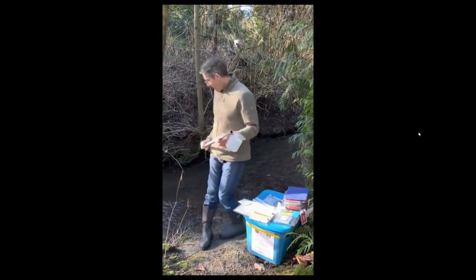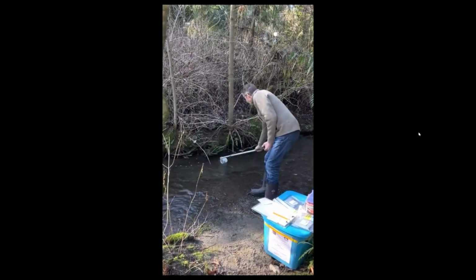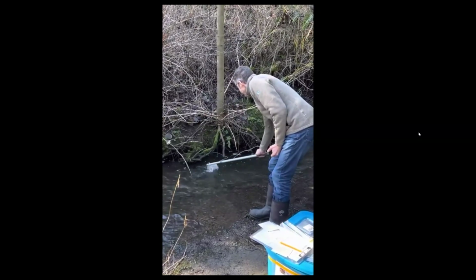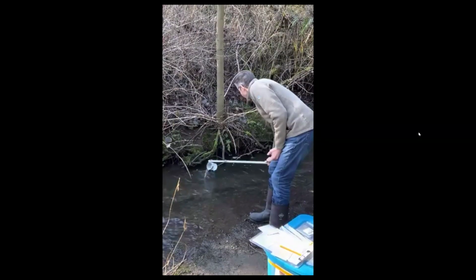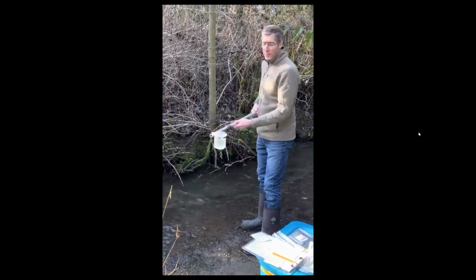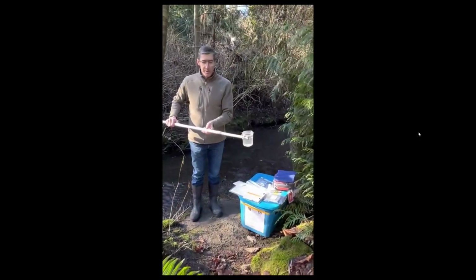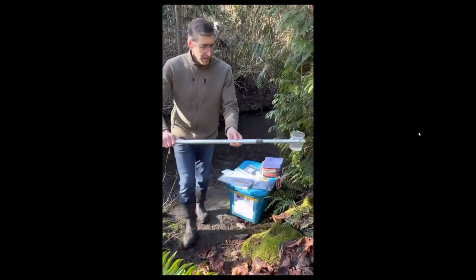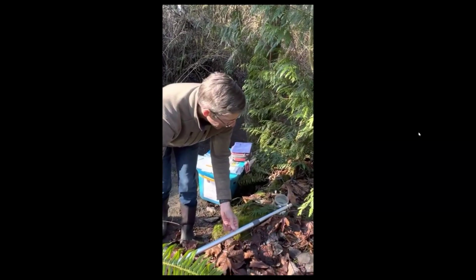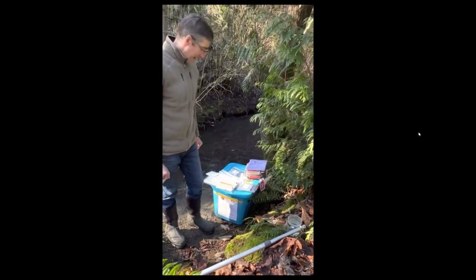So with the dipper, this is something that you're going to want to rinse out 2 to 3 times with stream water. Collect your sample. And this is something that some programs like because you can use this without getting into the stream. So I'm going to collect this sample and I'm just gonna set it somewhere stable. You could have a helper who holds it for you, or you can just put it somewhere where it's not gonna tip over so that you can pipette your sample out of that.